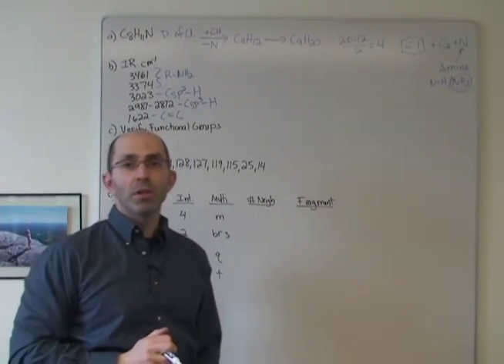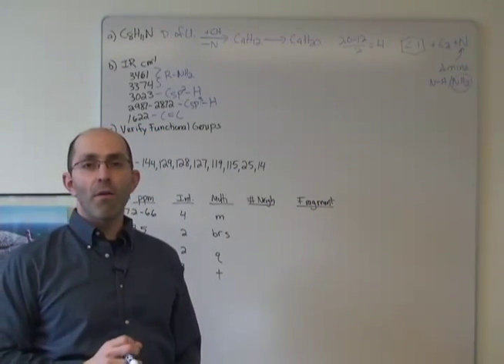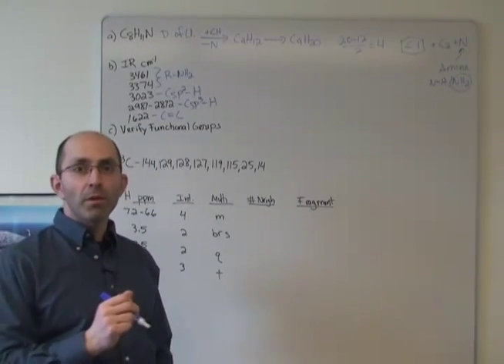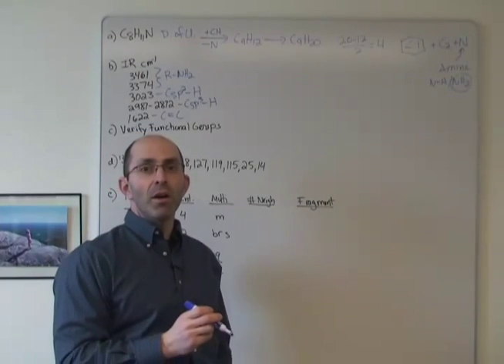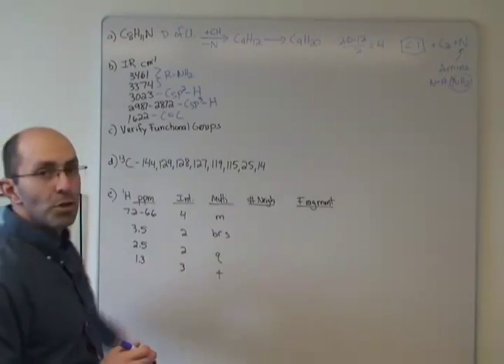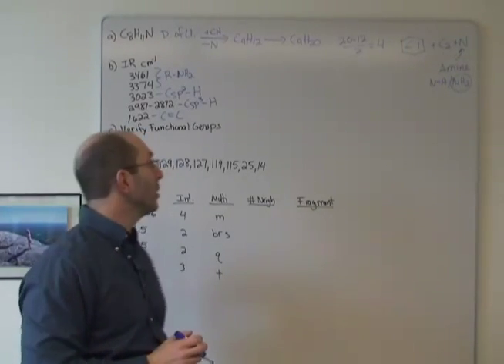bond, right? And it's really important when you're analyzing the IR, focus on the bonds that give rise to the peaks, because it's all about those bonds interacting with IR light. So every time you go through the IR, you should focus on the bonds giving rise to the peaks.